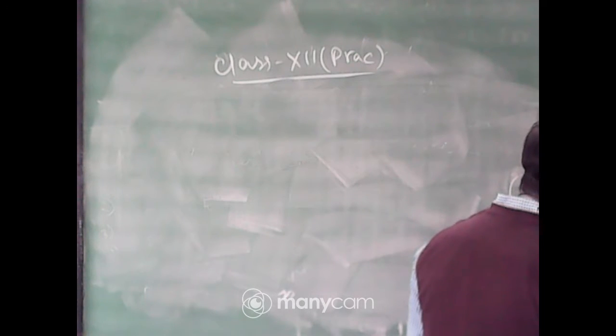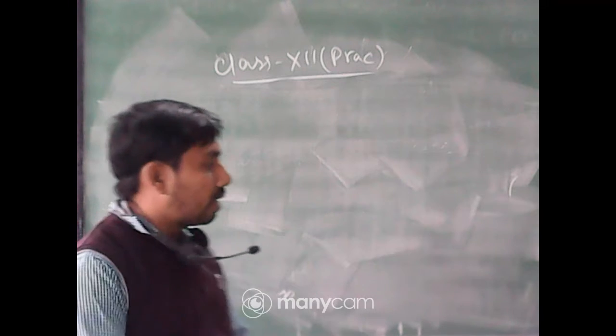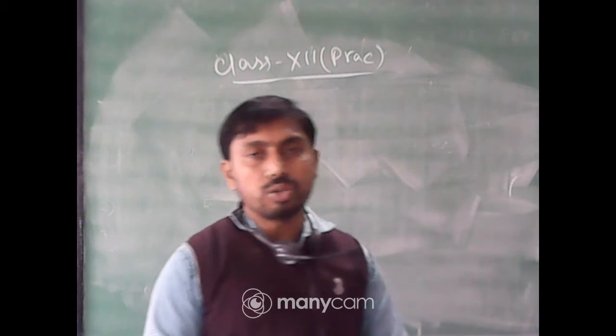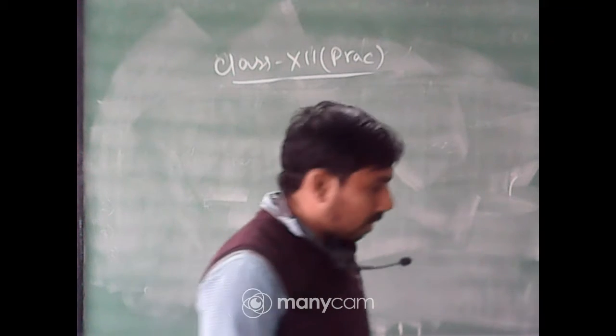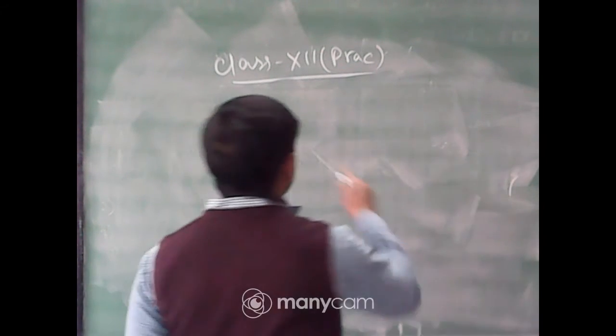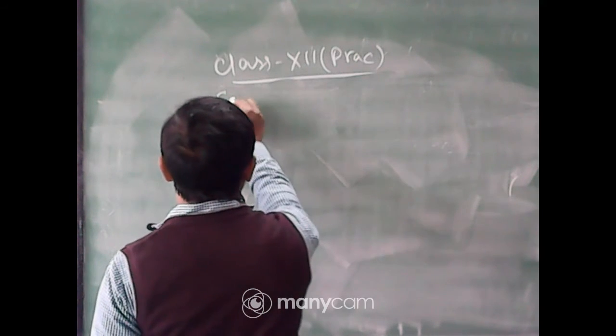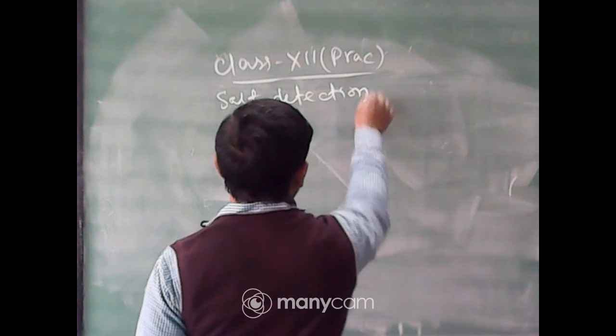So today, as a practical section, I will show you one unknown salt detection. Again, this is a topic from the inorganic portion: salt detection.